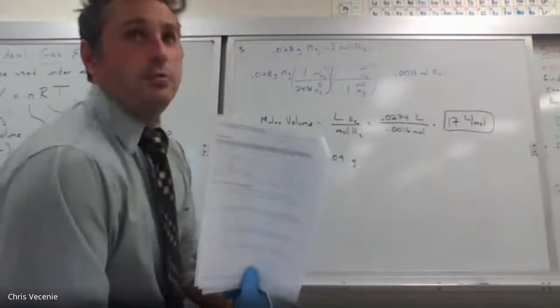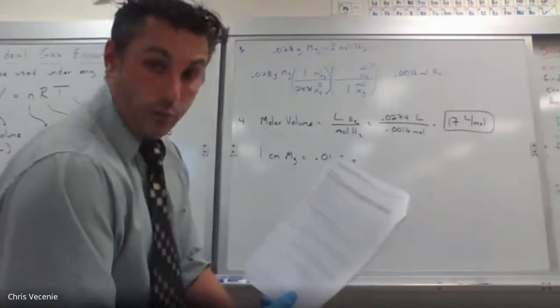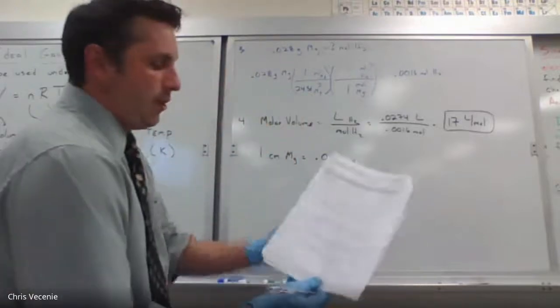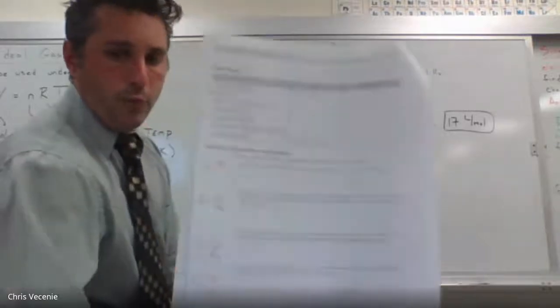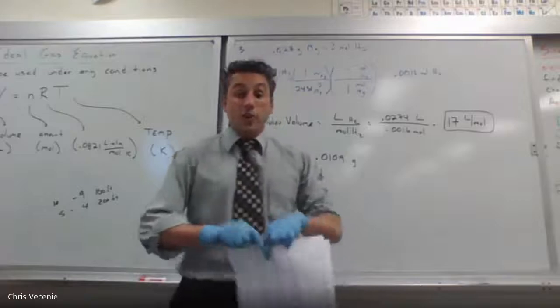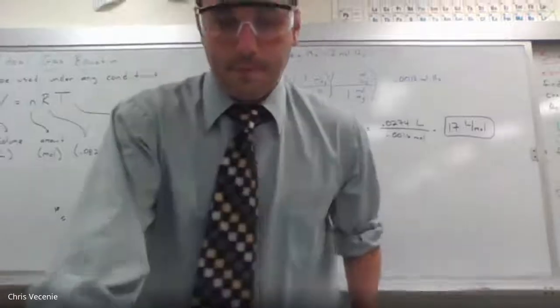Evidence of a chemical reaction. We're going to go back and look at that momentarily. Volume of H2 gas. We're going to look at that off the gas collection tube. Corrected volume of H2. Go ahead and put a star there. That's one of your post-lab questions. Temperature of your water bath. We'll take out a thermometer and see what the temperature is. And then last but not least, I told you before we even started that the barometer is the 761.3 that you see. So let's go to the back, get ourselves some of our numbers, and finish things up.